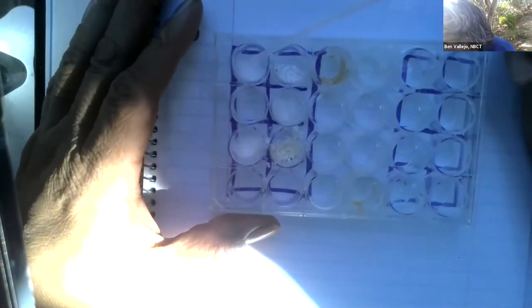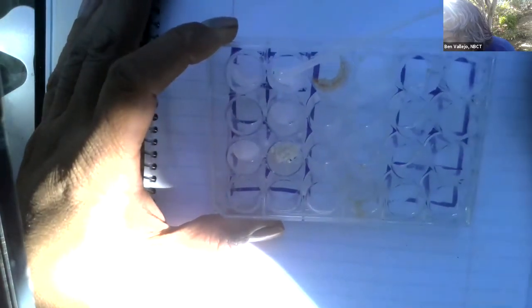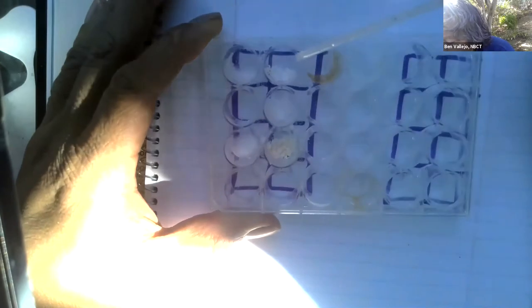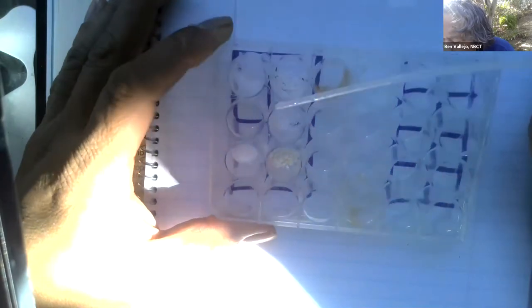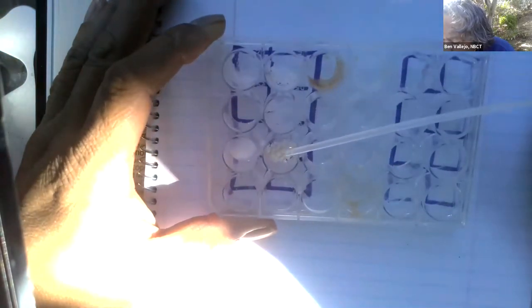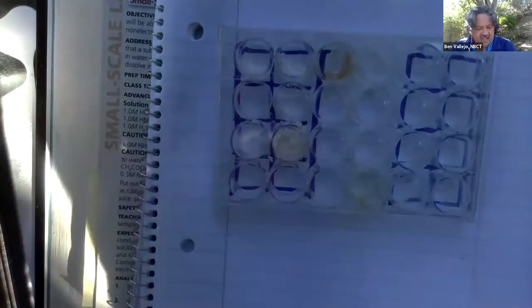So is 1 enough? No, 2, 3, that's probably pretty good. So I got 3 in the salt. I'm gonna put 3 in all of them. So let's go. 1, 2, 3, 1, 2, 3, 1, 2, 3, 1, 2, 3. All right. If I tilt it, this will work. But if I don't tilt it, will I get enough contact?